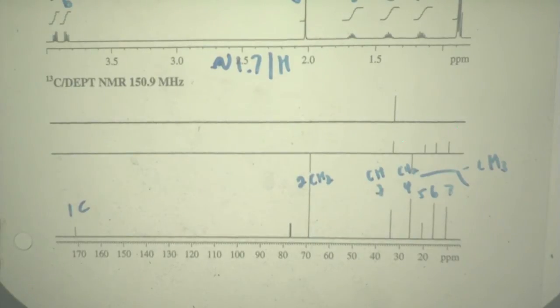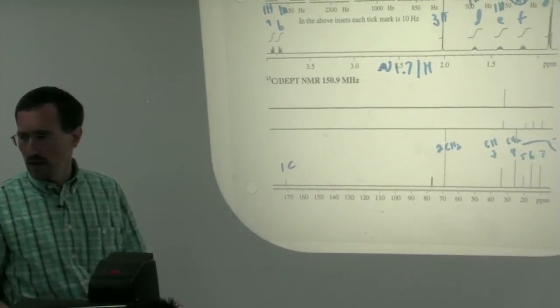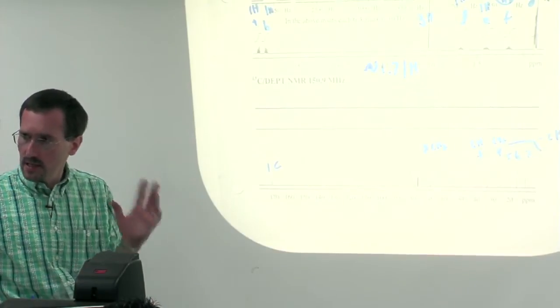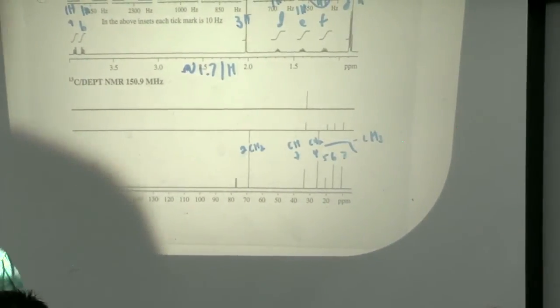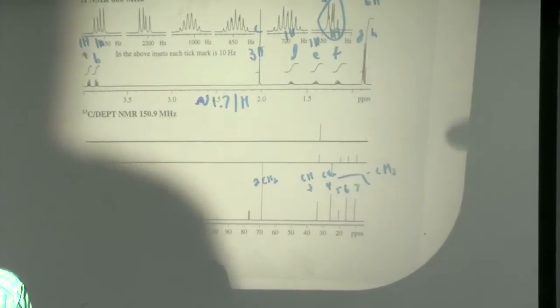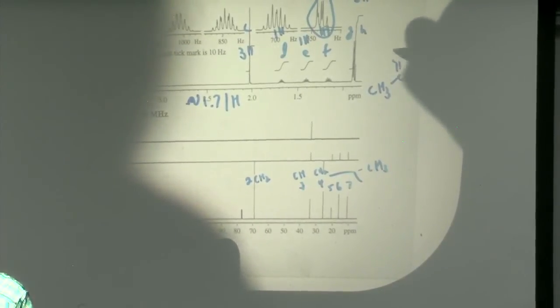Now, with these data alone, this is at the harder end of molecules to solve with just 1D data. It's not that you can't. You could easily puzzle out the structure, but I want to show us how 2D data is going to help us. Usually at this point, I jot some ideas down as fragments. I see I have a methyl group at 2, maybe indicative of a CH3.